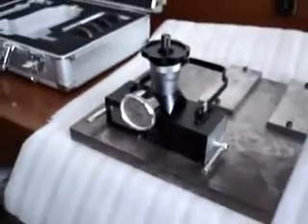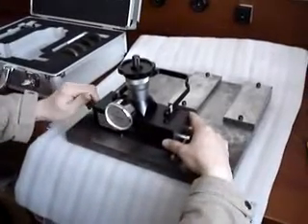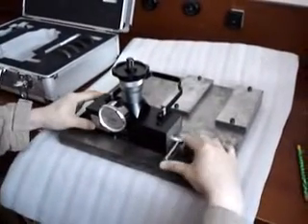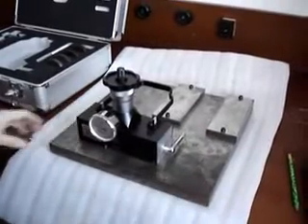First, fix the instrument. The instrument should be placed smoothly on the surface, and the two magnetic switches should be set at the protect position.